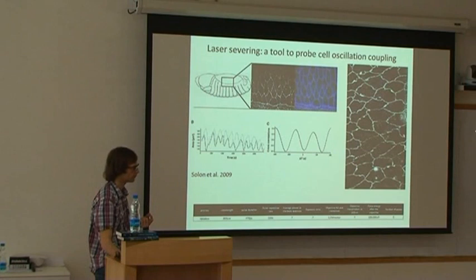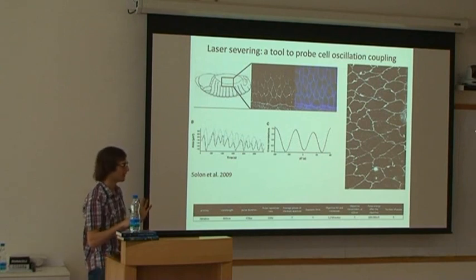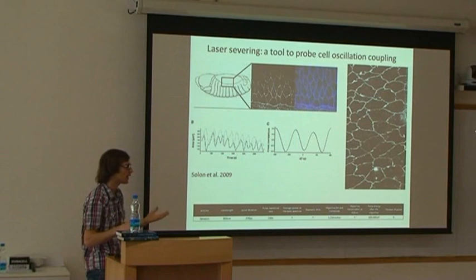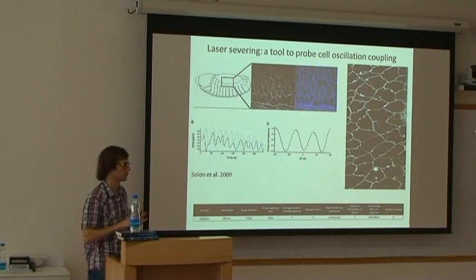What's the smallest region that you can ablate? As I said, at most 400 nanometers. Maybe it is smaller, but I do not know if I can make it even smaller. I know that the smallest at most is 400 nanometers.